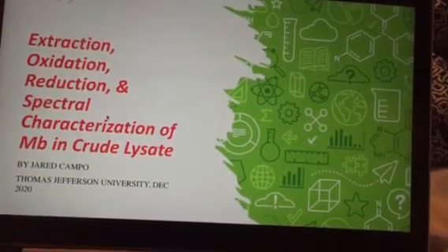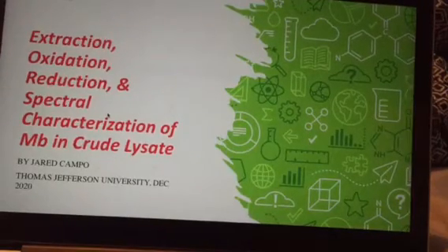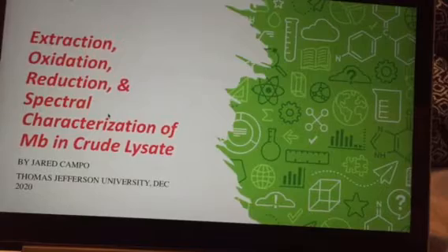I'm Jared Campo, and this is my presentation on the extraction, oxidation, reduction, and spectral characterization of myoglobin in crude lysate.